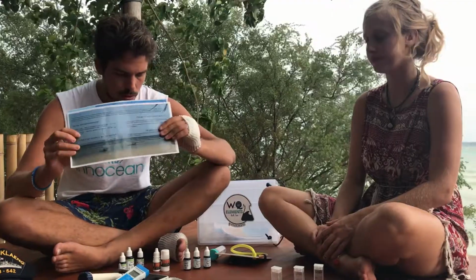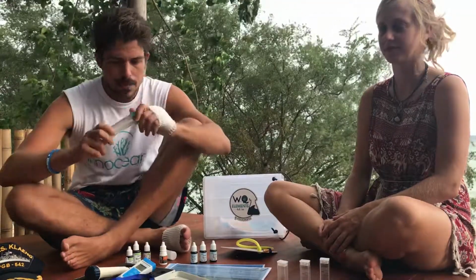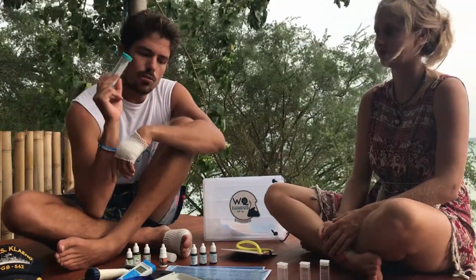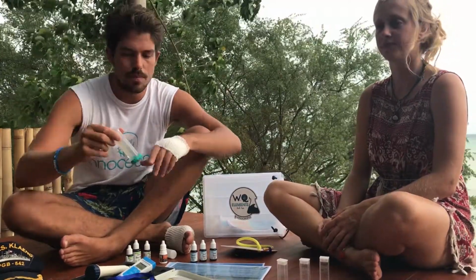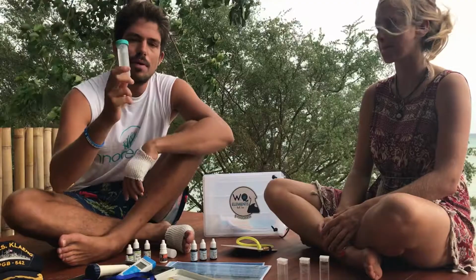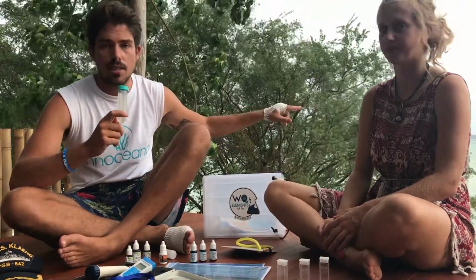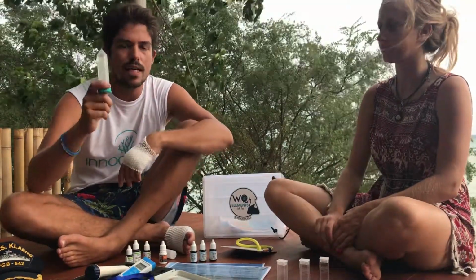Okay, so what you are going to do is take a water sample that you are going to put in a tube like this or something similar. In this case, this water is coming from this bay here, that is Chalok Bay, you probably know. And what we are going to do is check all the parameters. But before checking the parameters, there are some parameters that you are going to take under the water while you are diving. So imagine that in this case we have taken it on the shore, so we haven't been diving for this, but in many others, we have taken over 100 samples already, at different depths.